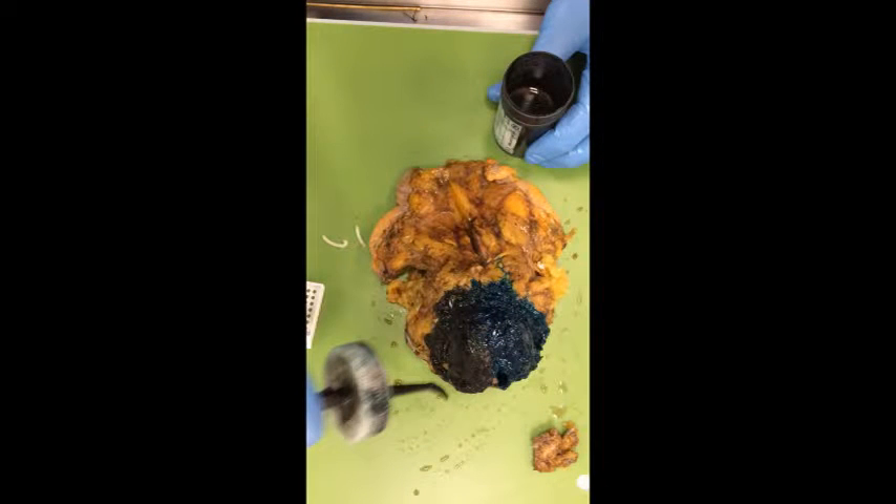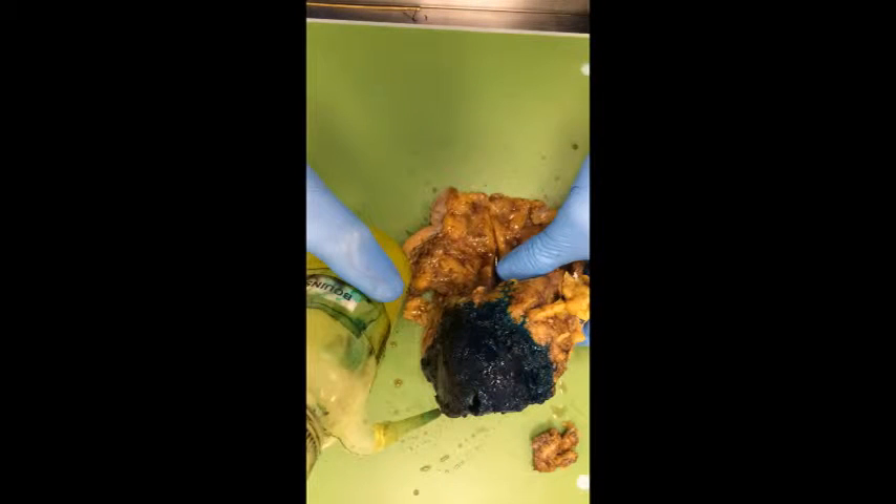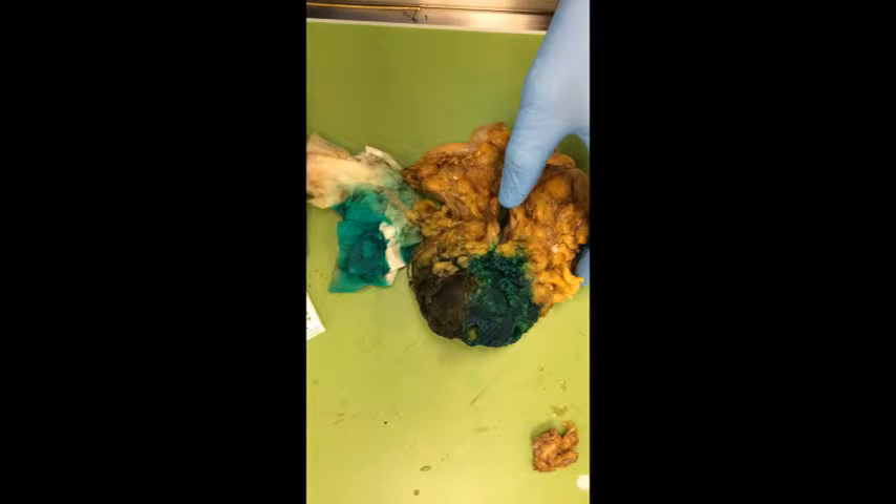Ink the left side green and the right side black. Spray with Bowen's solution to fix the ink to the prostate, then wash with water and dry.